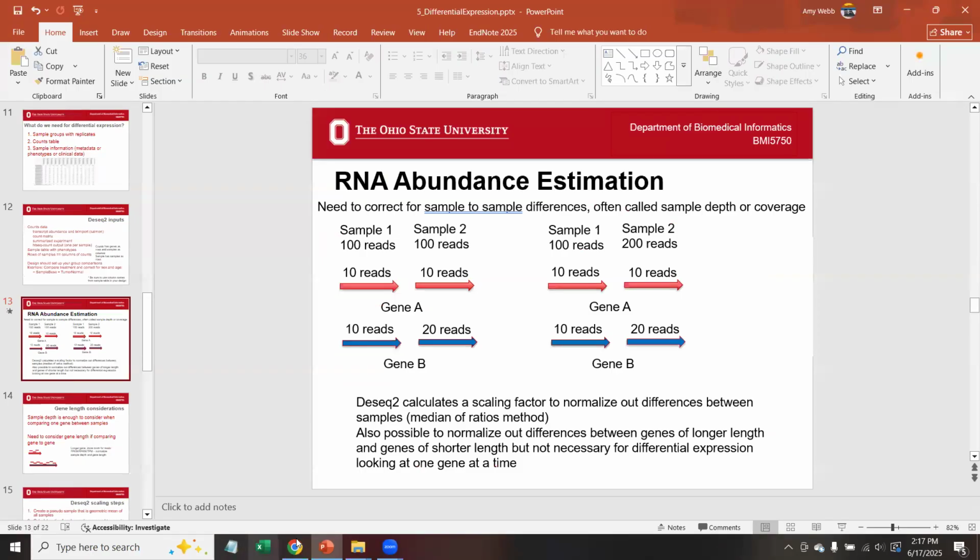Another question. For GEO, I found UMI counts versus read counts. UMI implies that there is a unique molecular identifier for each count. I would get probably just read counts. Make sure that this is not a single-cell data set.